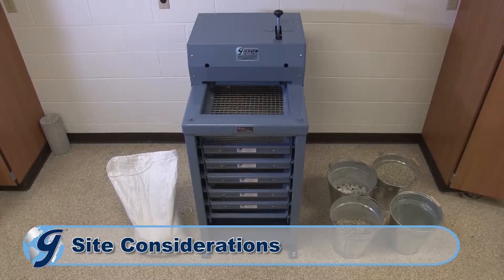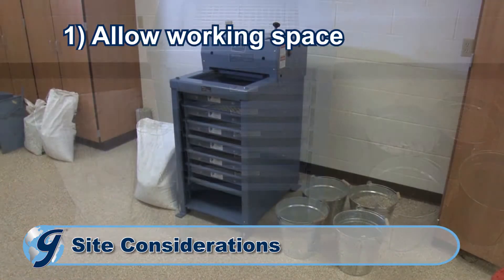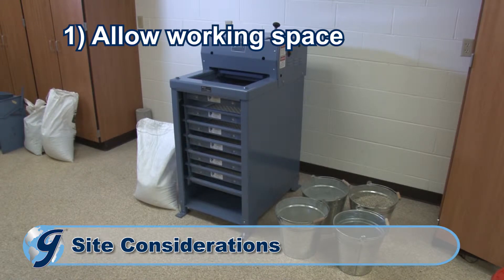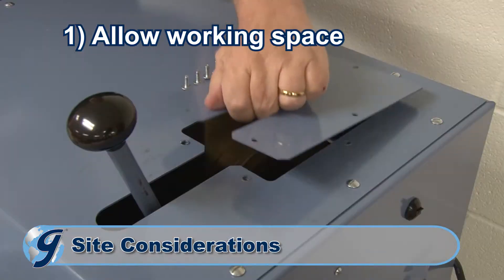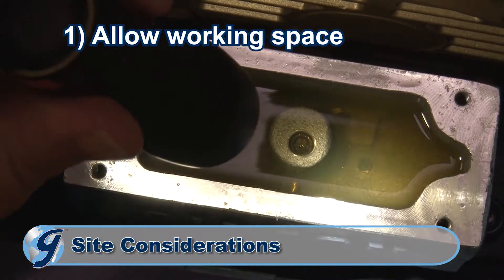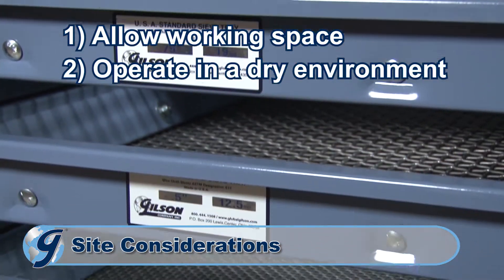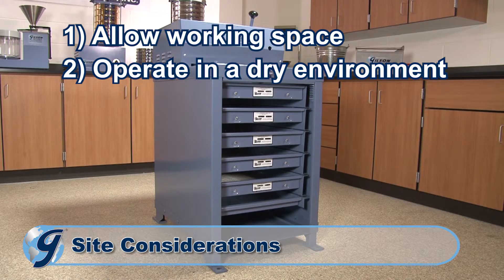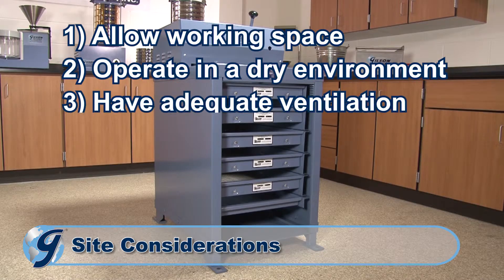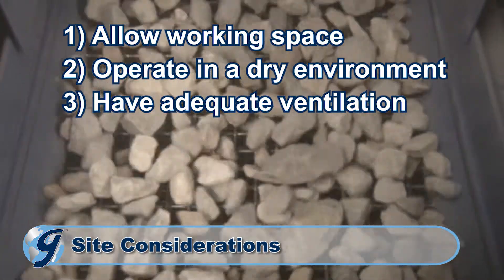Site considerations are the first step in pinpointing your operational testing screen location. Be sure to allow enough space around the machine for adequate material handling, the installation and removal of screen trays, and maintenance on the machine on all sides. For best results, operate your testing screen in a dry environment that is free from excessive moisture or hazardous conditions. There can be considerable dust generated during operation, so be sure the area has adequate ventilation.